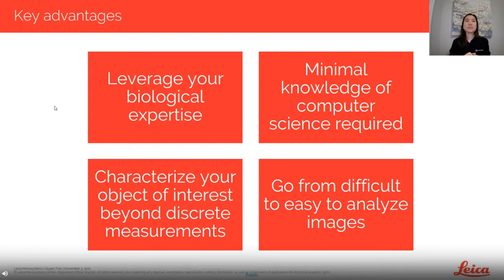It allows you to utilize your biological knowledge to provide those examples instead of those rules that may be required and may utilize discrete measurements that you have to figure out. And it allows you to go beyond those discrete measurements to characterize your objects and go from difficult images to analyze to making them easier to analyze.